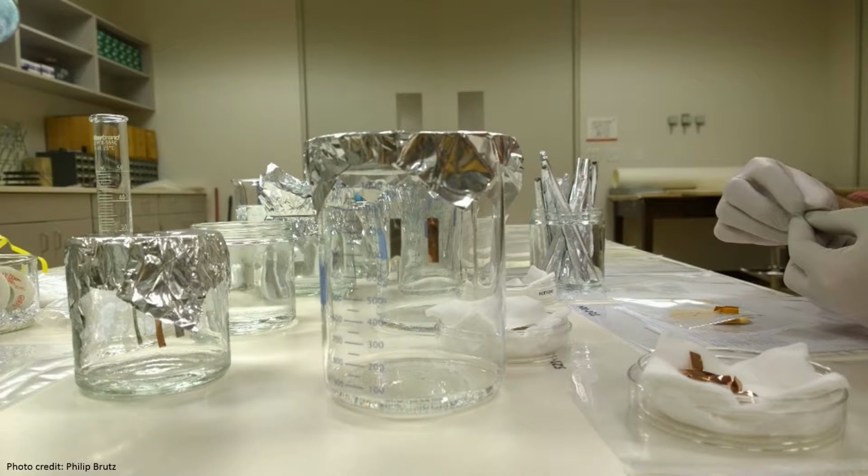So in the foreground of this slide, you see accelerated and ambient control test vessels. Each test batch includes a control, which contains everything the material sample tests include, except for the material sample. So the metal coupons are suspended by themselves in their higher RH test vessels. The control establishes a baseline for the amount and type of corrosion I'll be checking for on the other coupons. There should be very little or no corrosion present on the control coupons at the end of the test.